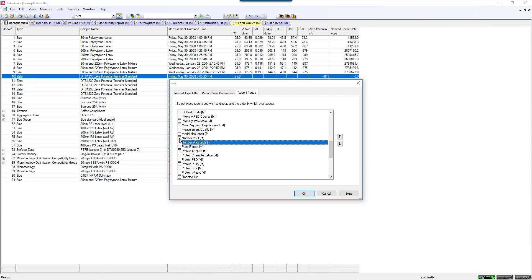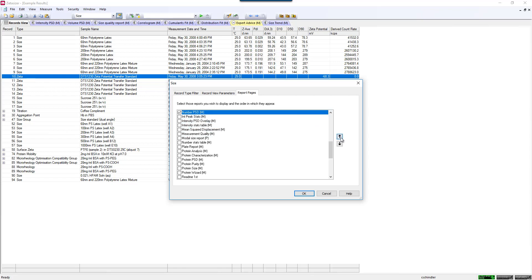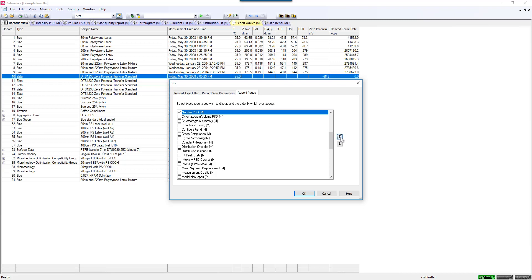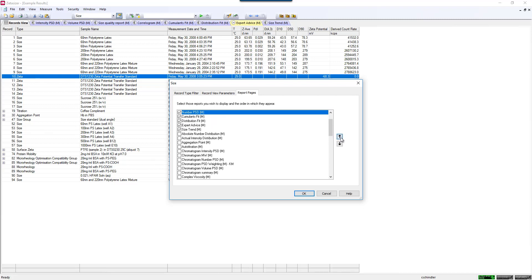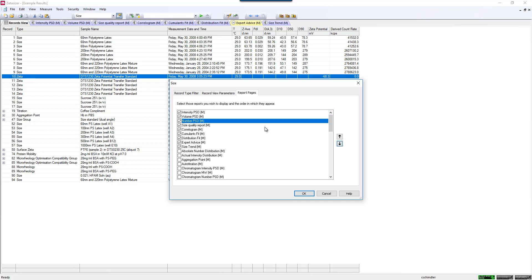I do have some people wanting to look at the number distribution, although I generally frown upon that with DLS since you are only measuring the intensity distribution for raw data. But this is how you would display your number distribution if you wanted to see that as well. I can move this up so that I could put it first or third or add it to my list that would display here.